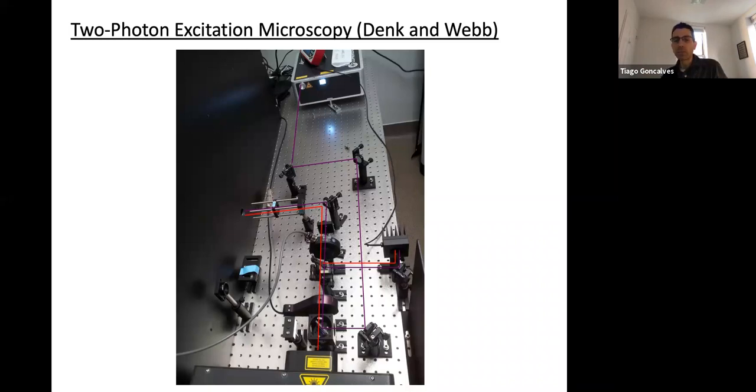So you have a half wave plate to align the polarization of your laser light, and then you have a polarization beam splitter here, which basically either allows a certain polarization, say this direction, and then the other polarization goes into a beam dump. So you're just dumping whatever part of the beam you don't need, whatever laser power you don't need. You just set it to the side and put it against a cinder block or whatever. There's other ways of doing this.